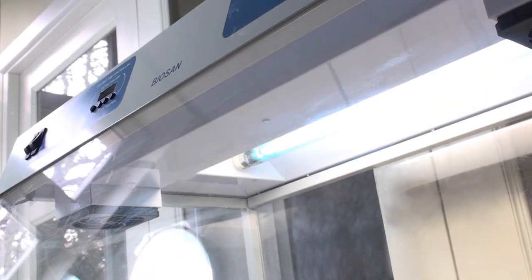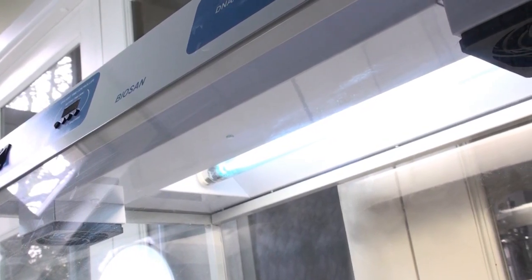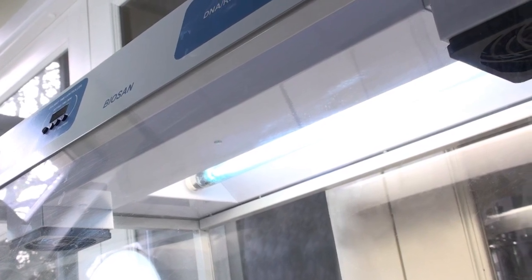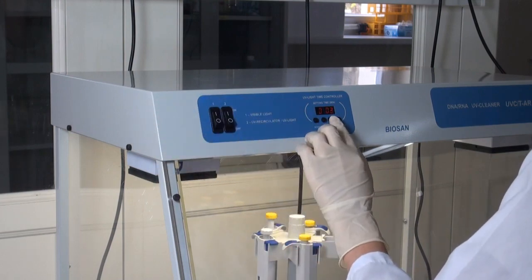UV cabinets are equipped with an open UV lamp installed in the upper hood. UV radiation from the open lamp disinfects the working area by inactivating DNA-RNA fragments during 15-30 minutes of exposure. A digital timer controls duration of the direct UV irradiation.